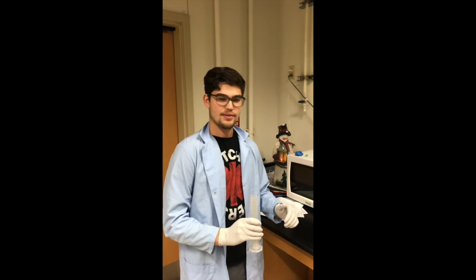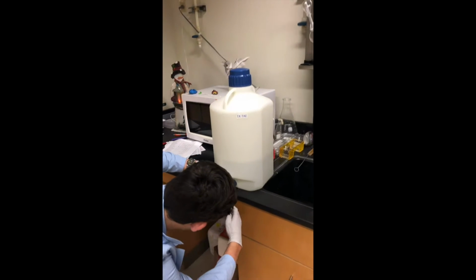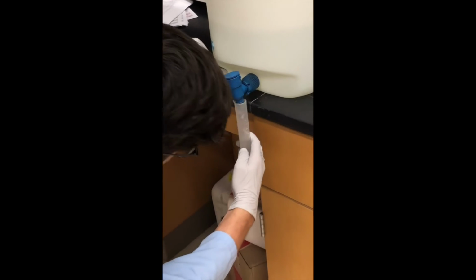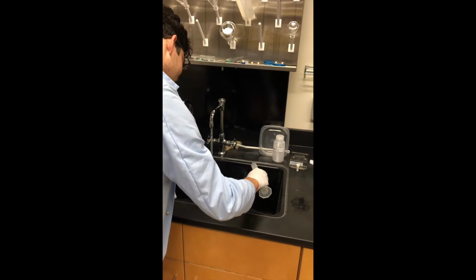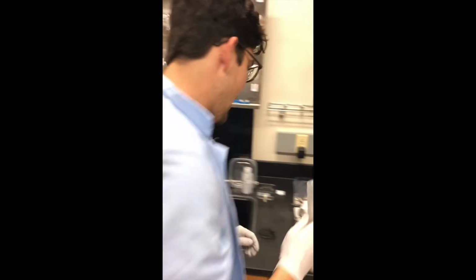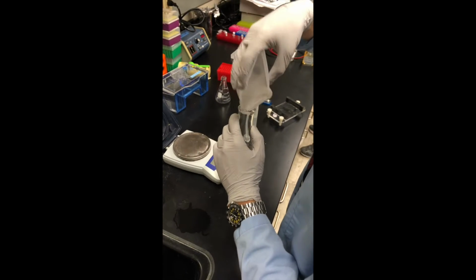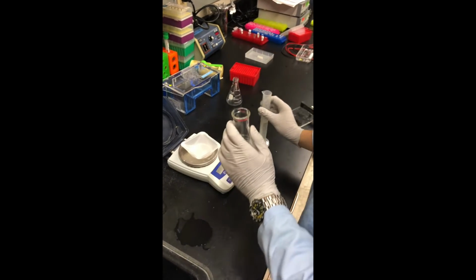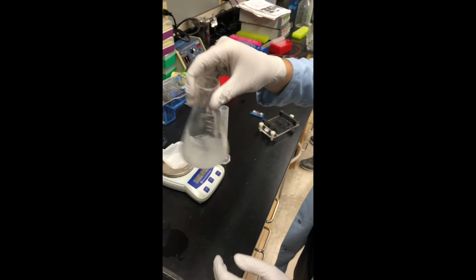Moments later. Okay, so here now we're going to measure out 25 milliliters of TAE. I measured a little bit too much, so I'm going to have to pour a little extra out. Alright, that's about good. So next we're going to combine your agarose and your TAE in the flask. Alright, and you're going to mix it up in there. And then we're going to put it in the microwave for about 30 seconds.